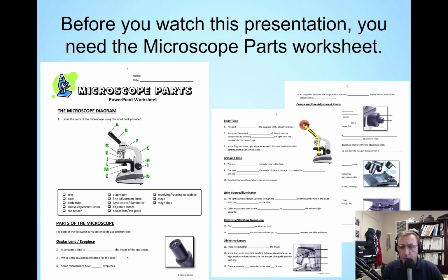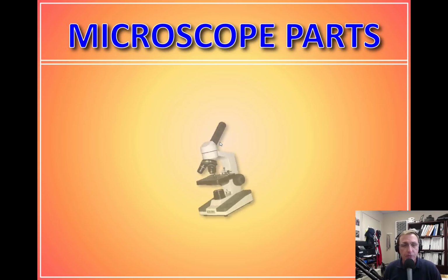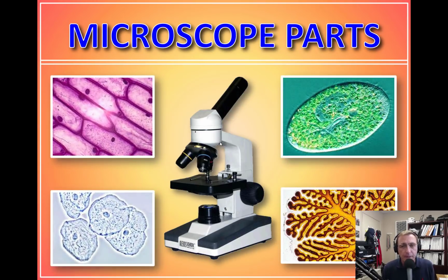Okay, so we have this 3-page worksheet to go through, a lot of slides, a lot to cover, including our own microscopes and the teacher microscope. So let's get started. There we go. Fancy animation, waste of time. All right, microscope parts, everything you want to know about microscopes, but are afraid to ask. Here it is for you live from my office.